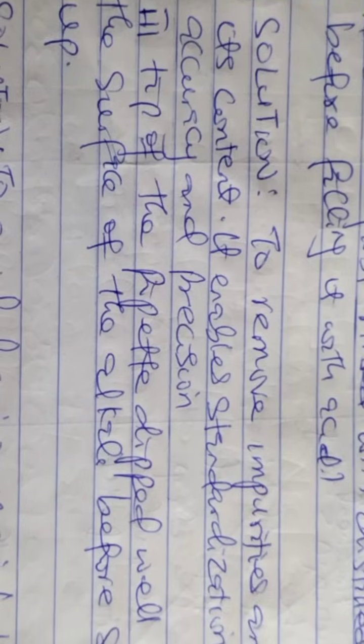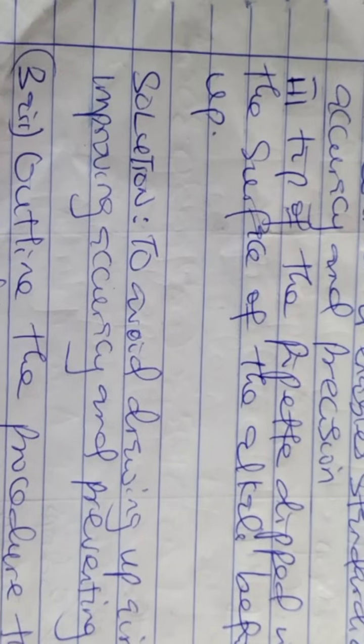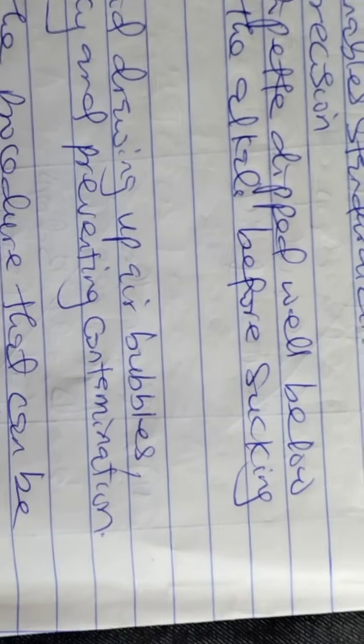Number III. Why is it that the tip of the pipette is deep well below the surface of the alkali before sucking up? Solution: to avoid drawing up air bubbles, improving accuracy and preventing contamination.